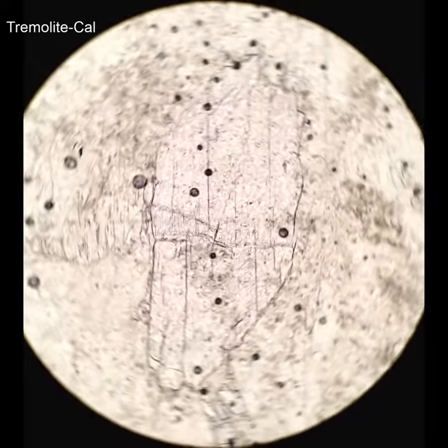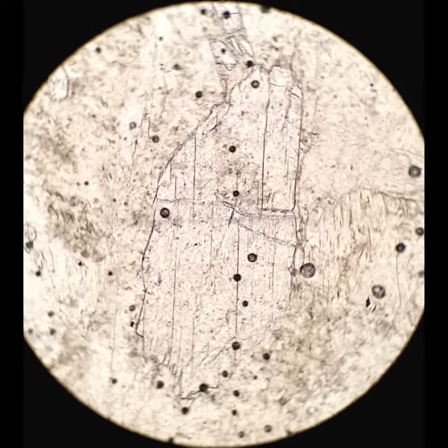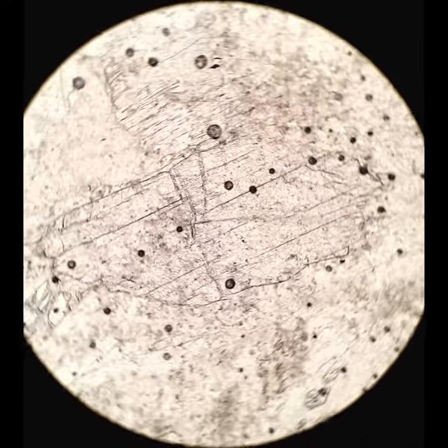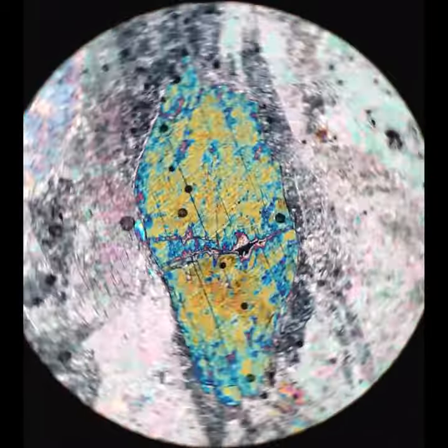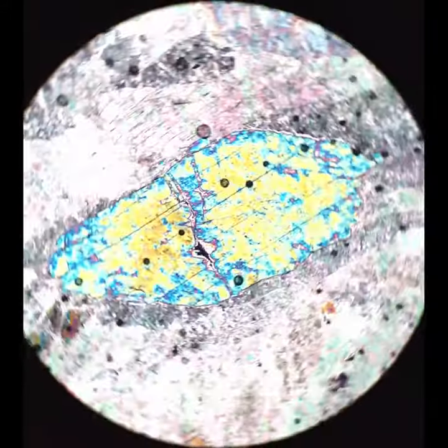This is my one sample with end-member tremolite in it. Tremolite is a calcium magnesium end-member amphibole. This rock is absolutely brilliant white. Actinolite in hand sample is green, sort of an apple green color. So how do you know that this isn't just actinolite? Really, it's almost impossible to tell. It does not have that pale green pleochroism, but otherwise the optical characteristics are virtually identical.